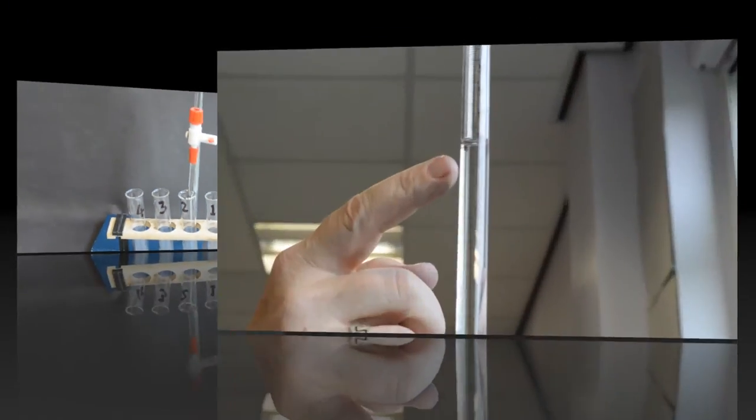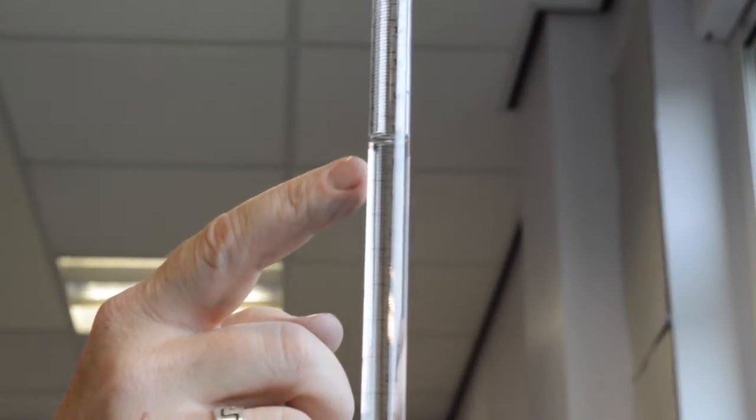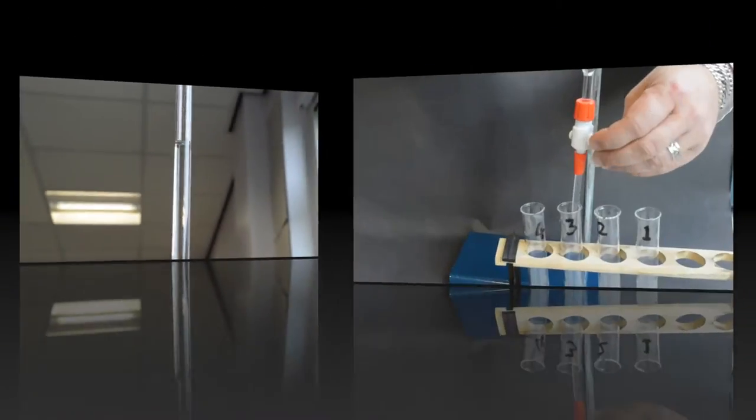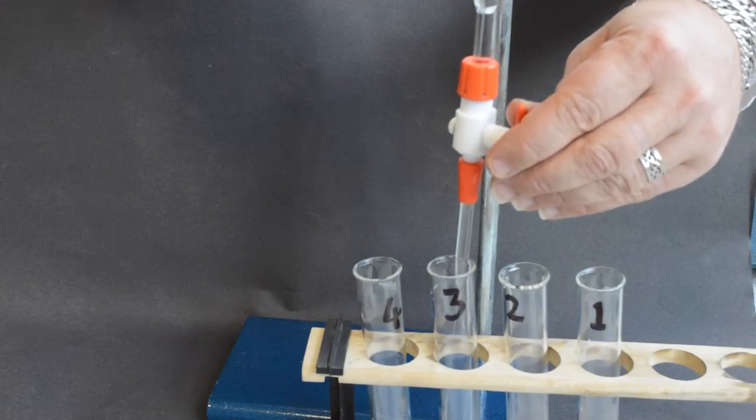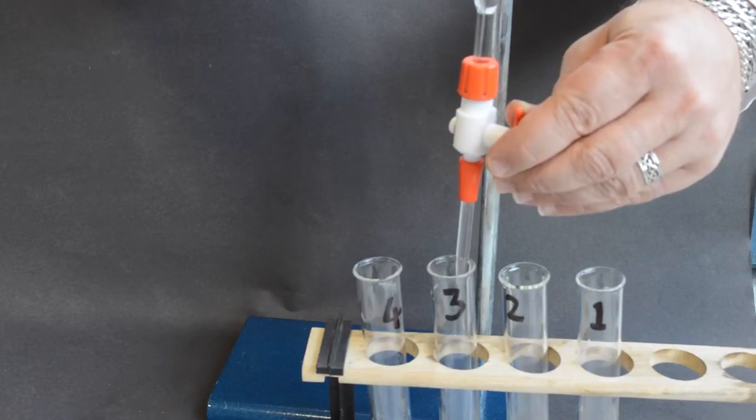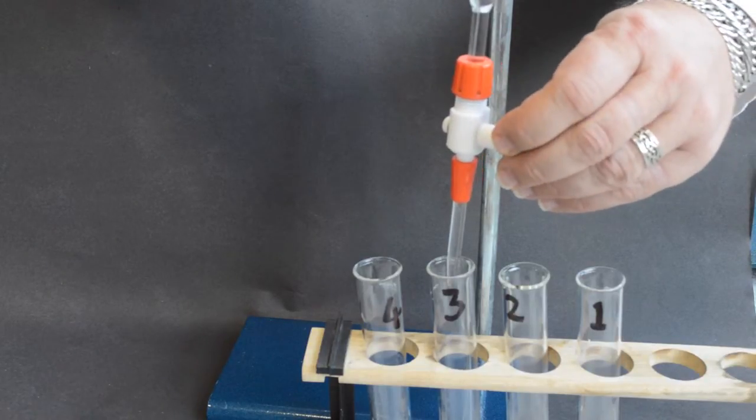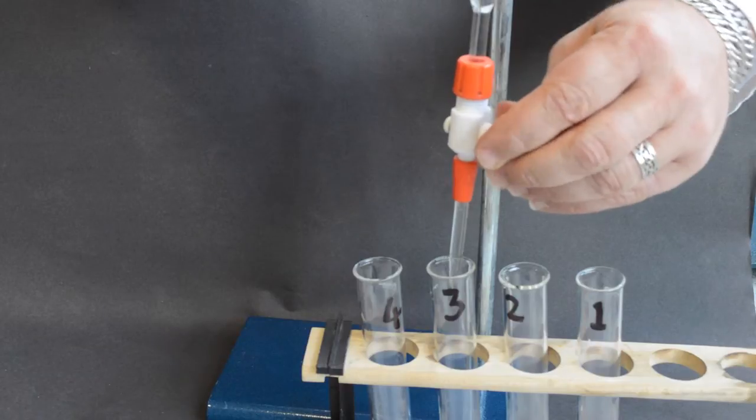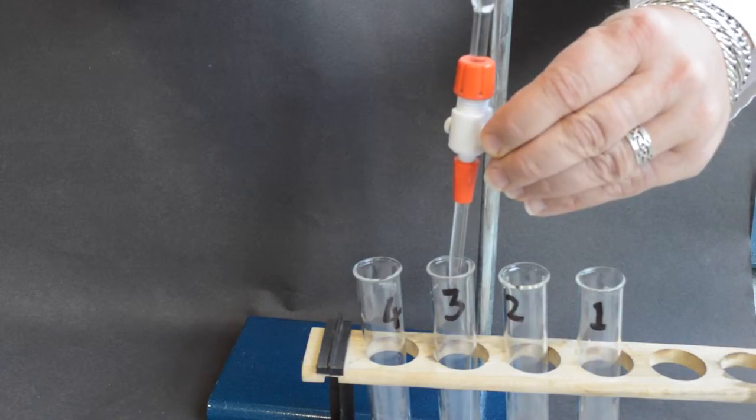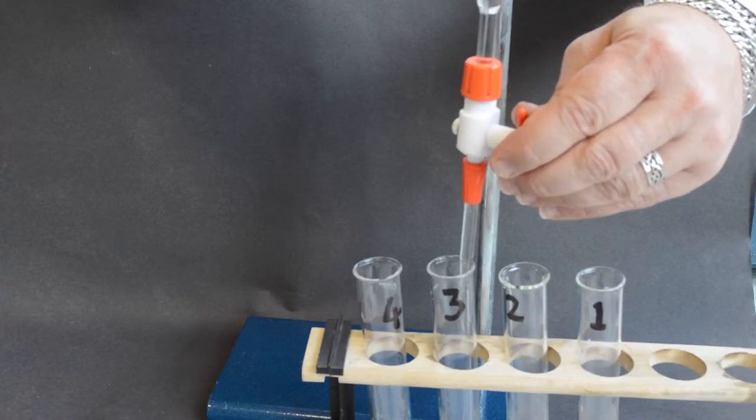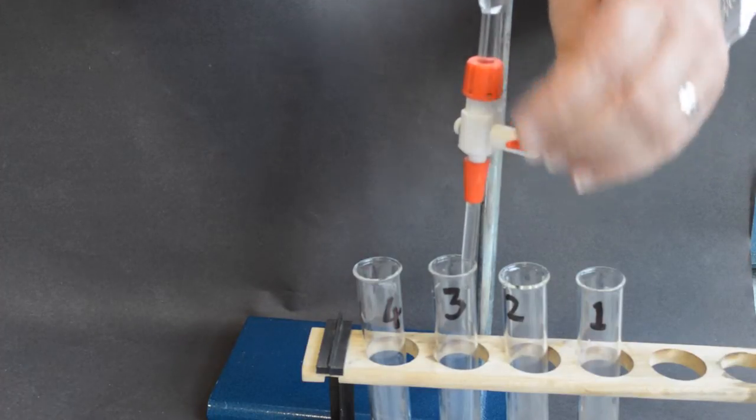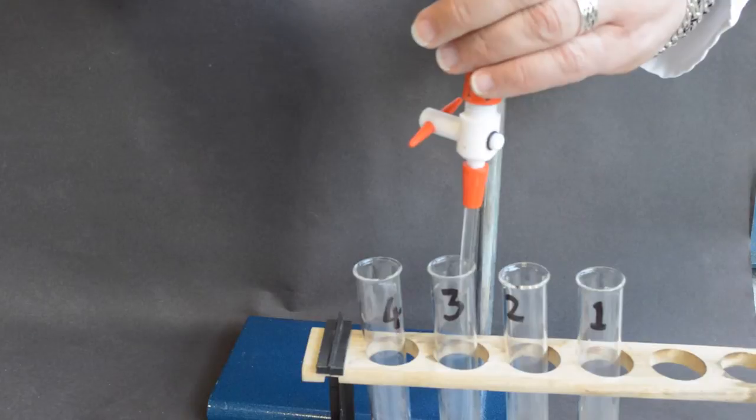Note the end volume in the burette. Repeat this step with tube number three, adding only seven milliliters of water to this tube. Repeat this process with decreasing volumes of distilled water for tubes four to nine.